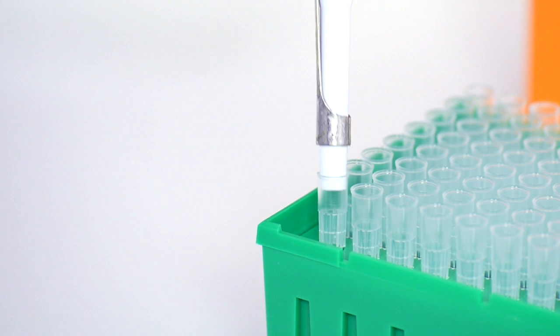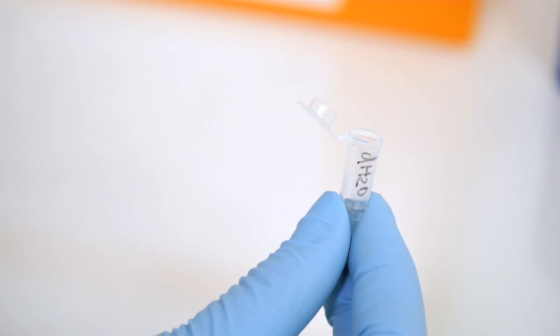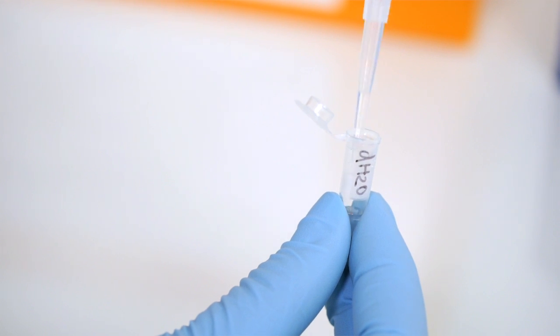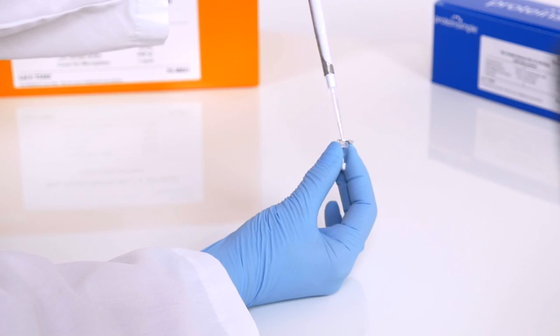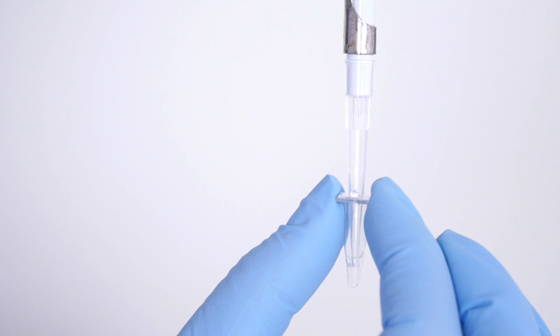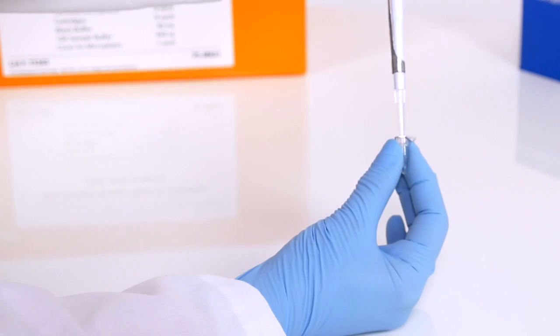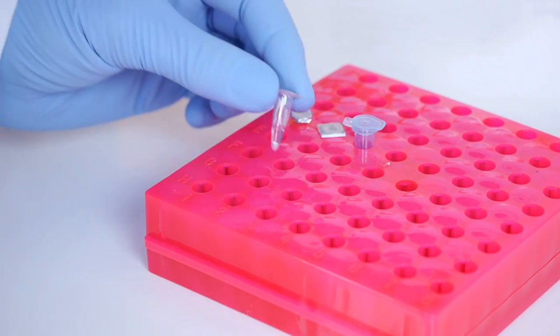We'll start with preparing the DTT. Pipette 40 microliters of water into the clear DTT tube. Gently mix by pipetting up and down a few times. This will give you 400 millimolar concentration of DTT solution.